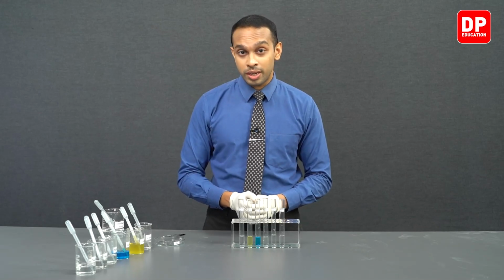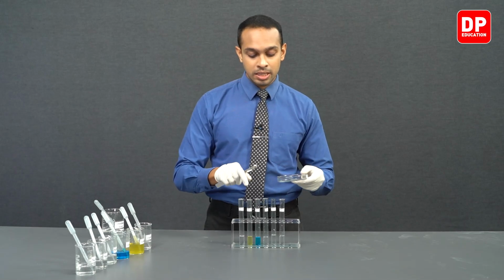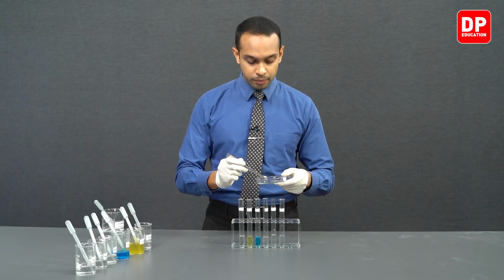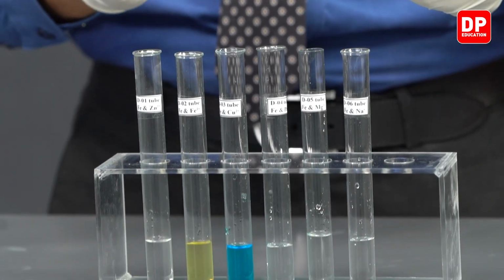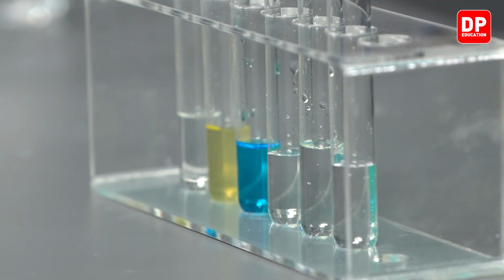Now we are going to add our iron metal pieces into each of these test tubes. So let's add a few pieces of metal iron into each of these test tubes.